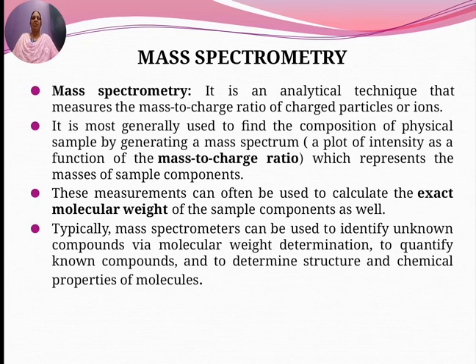These measurements can often be used to calculate the exact molecular weight of the sample components as well.